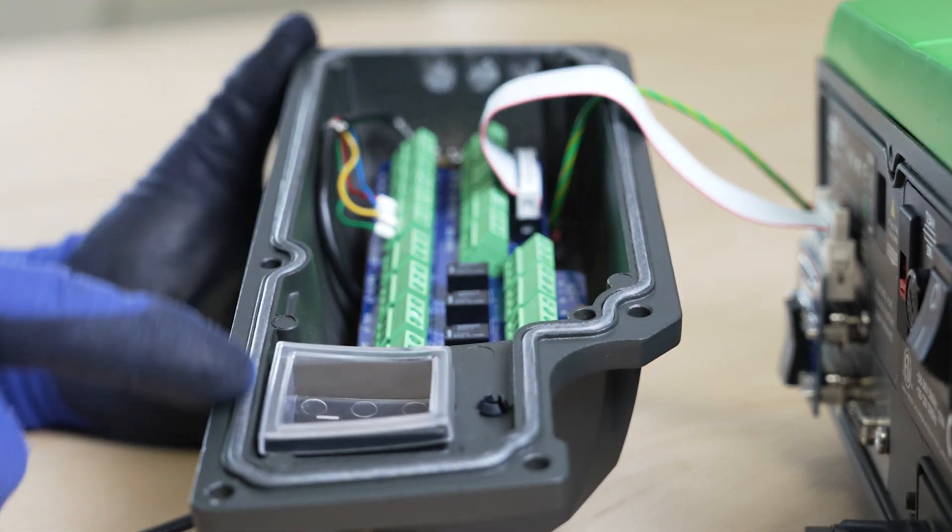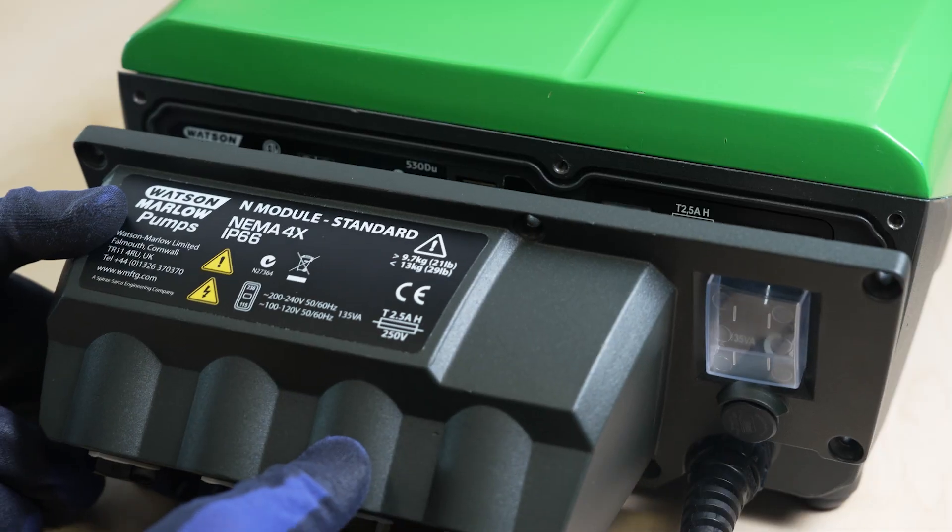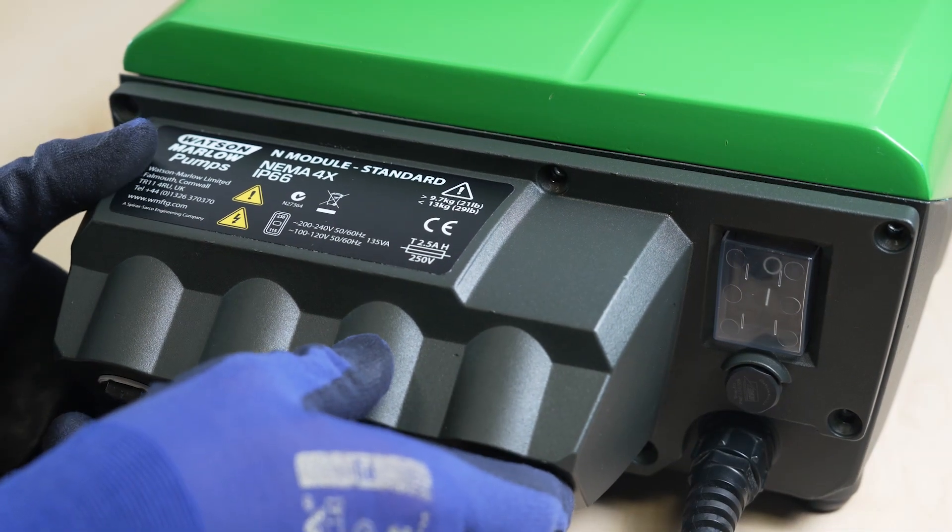Check the integrity of the seal and the switch membrane. Reattach the end module to the back of the pump with the six screws.